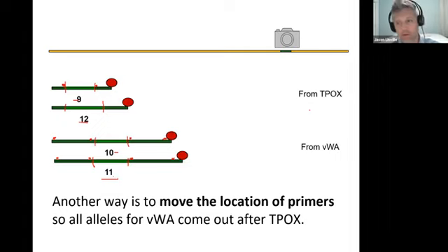Okay, now here's where it gets a little tricky. Which of these alleles is going to come out second? Which is going to come out after the 9? Because we know the smaller pieces of DNA travel faster, okay? So you may look and go, well, wait, the 10 is the, but no, we're looking for the total fragments of DNA. Remember, this area, the light green area that represents the repeat, okay, that's not going to affect the total size of the DNA.